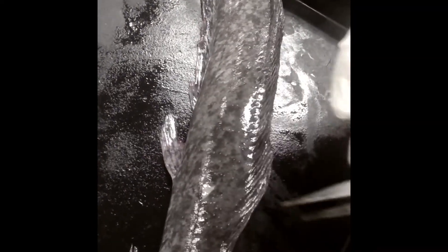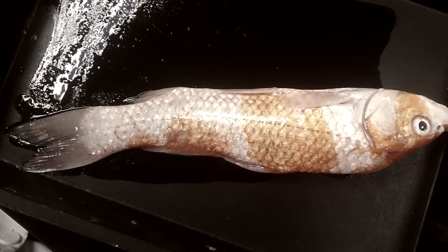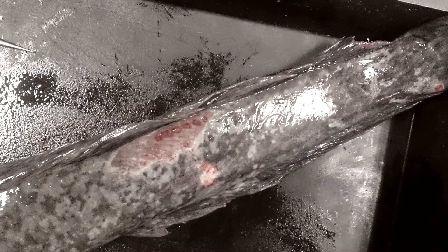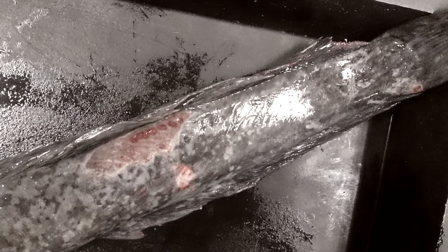Before anything is done to the fish, we must take the physical measurements of the fish, like the weight and the length. And then we observe the fish condition, such as any lesions or anything abnormal experienced by the fish.